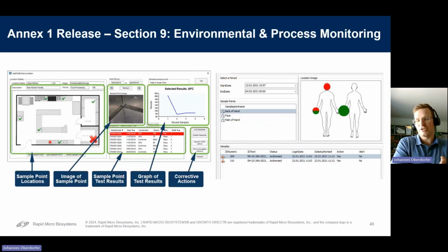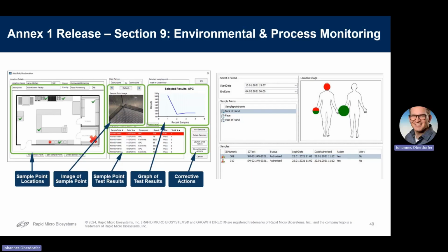And here there was just an example of what helps us, and these are air monitoring software and programs where we know which spot, a picture of the spot, the limits, how often we monitor, and that we see already with one click, oh yeah, we are well within the limits or we are out of the limits.